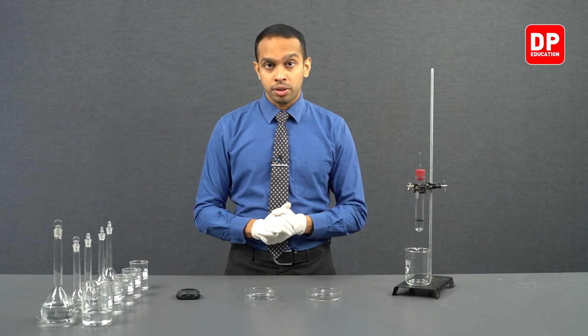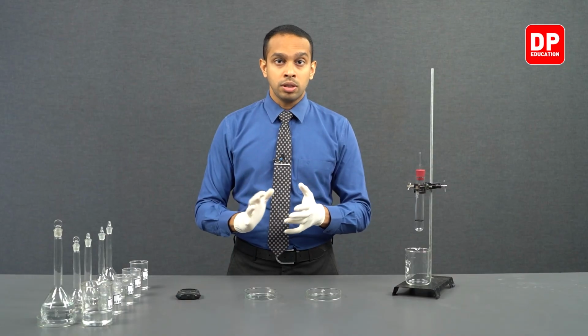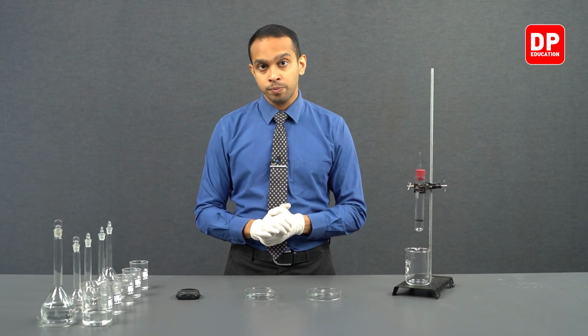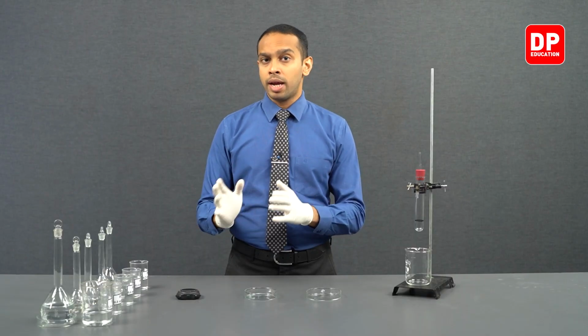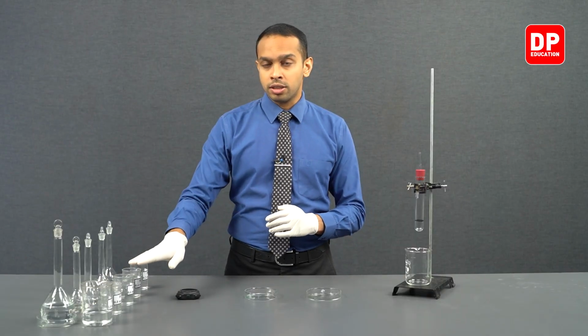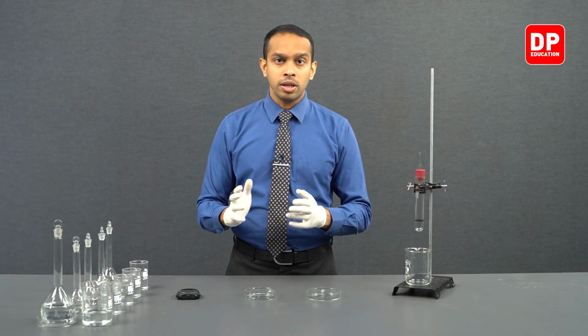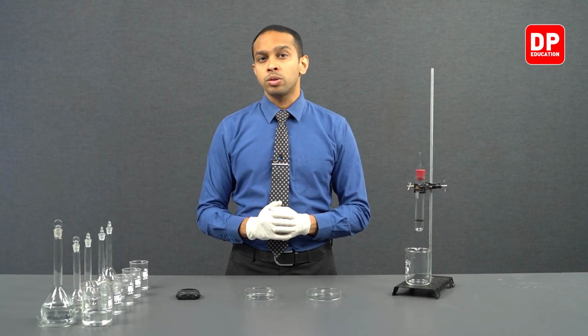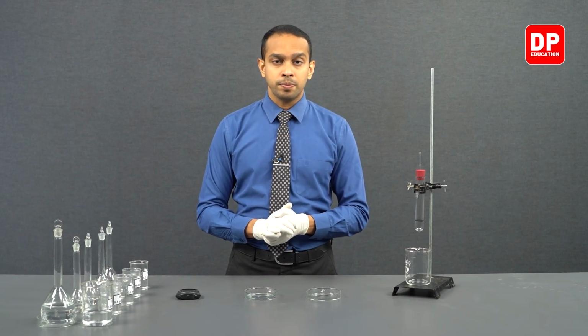We are going to measure the rate of this reaction by collecting a constant volume of hydrogen gas. We are going to observe, when magnesium is reacted with these different HCl solutions, how long it actually takes for each of these reactions to produce a constant volume of hydrogen gas.